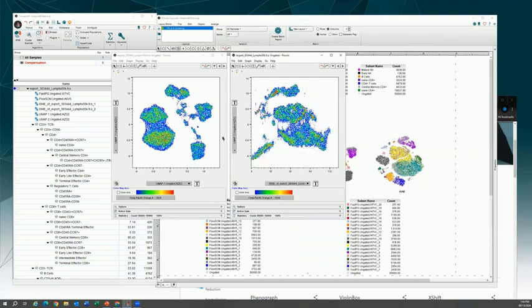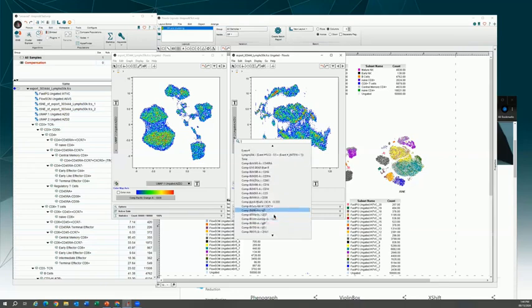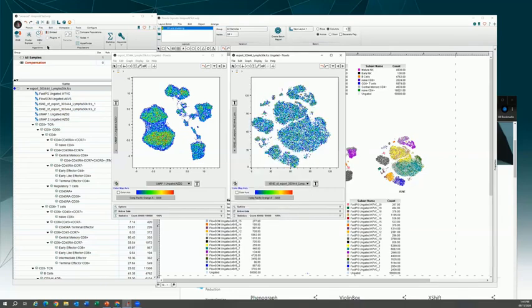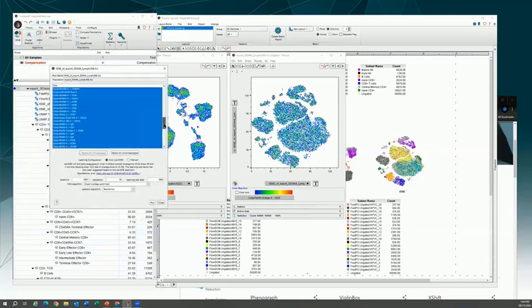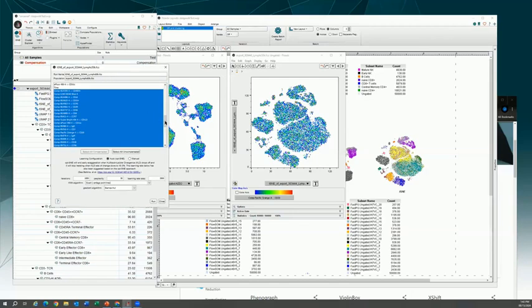And I ran a couple different embeddings. I ran tSNE with like the default settings. Let's just take a look at tSNE. I excluded some markers here because I didn't want to get into really fine local structure of the data. I wanted a less detailed embedding just for the purpose of this webinar, to show some of these next things we'll be talking about.